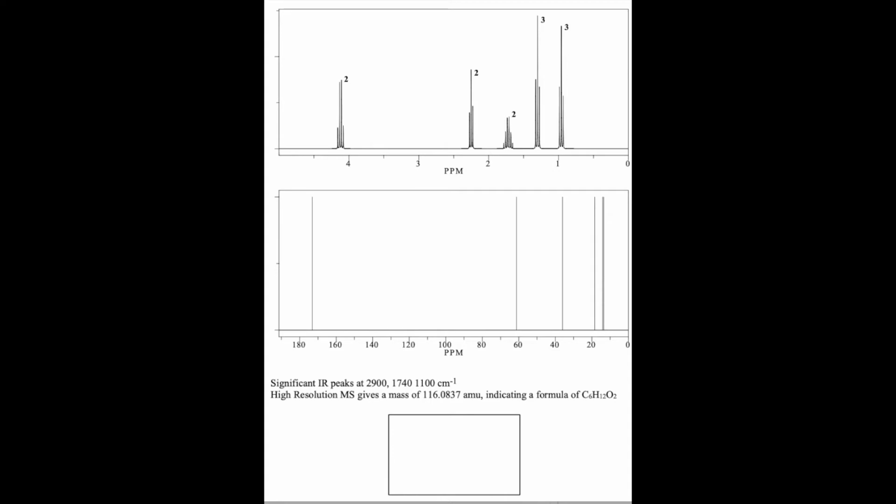So last, we're going to spend an awful lot of time looking at the proton NMR, because that's really where the main power is. I really would resist the urge to jump directly into the proton NMR. Again, doing all this background stuff first really helps you to start making educated guesses up here with the proton NMR. If you haven't figured out that, oh, this formula only has oxygens and, oh, it has a carbonyl, you're going to be making bad guesses rather than educated guesses.